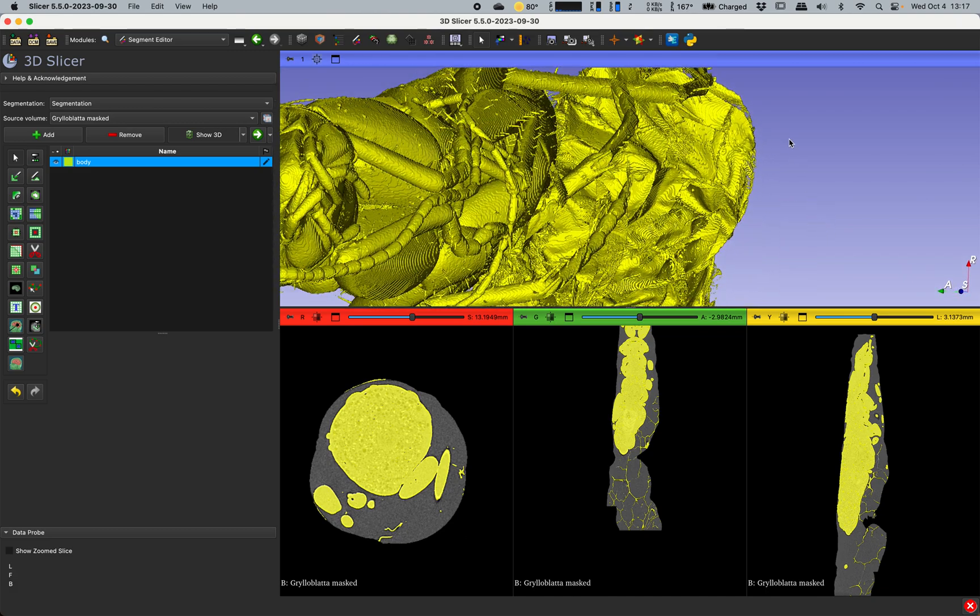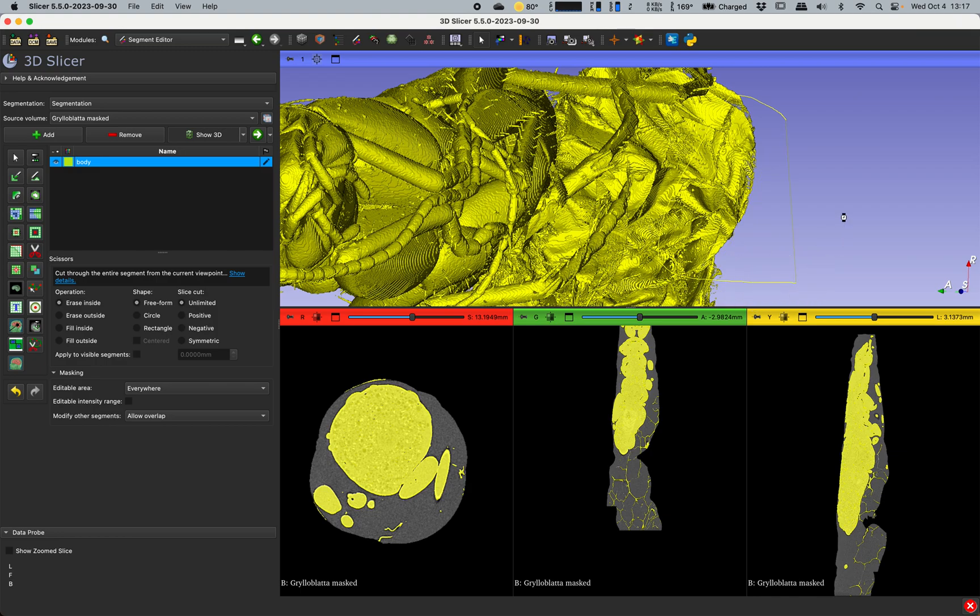Sometimes I will try and look down the length of the insect so I can kind of get as many slices as possible and cut out as much as I can. So it just takes a little bit of practice to figure out what are the best way to do this with your specimen.